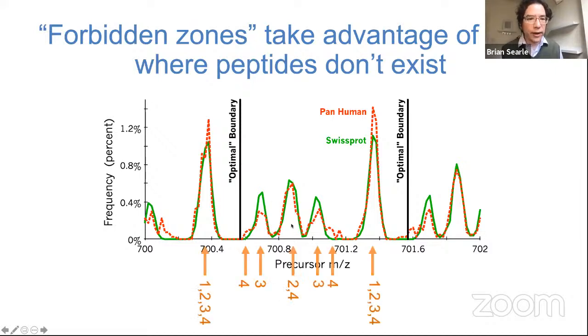And they fall in these kind of peaks where you expect, so any peptide that has a +1, a +2, or +3 charge falls in this particular high peak. +4s are in the shoulder, +3s are in this peak here, +2s and 4s are in this peak here, +3s are here, +4s are in the shoulder. And again, you get to the next monoisotopic peak where you get +1s again. So this is where you expect to find peptides, where you see these signals.